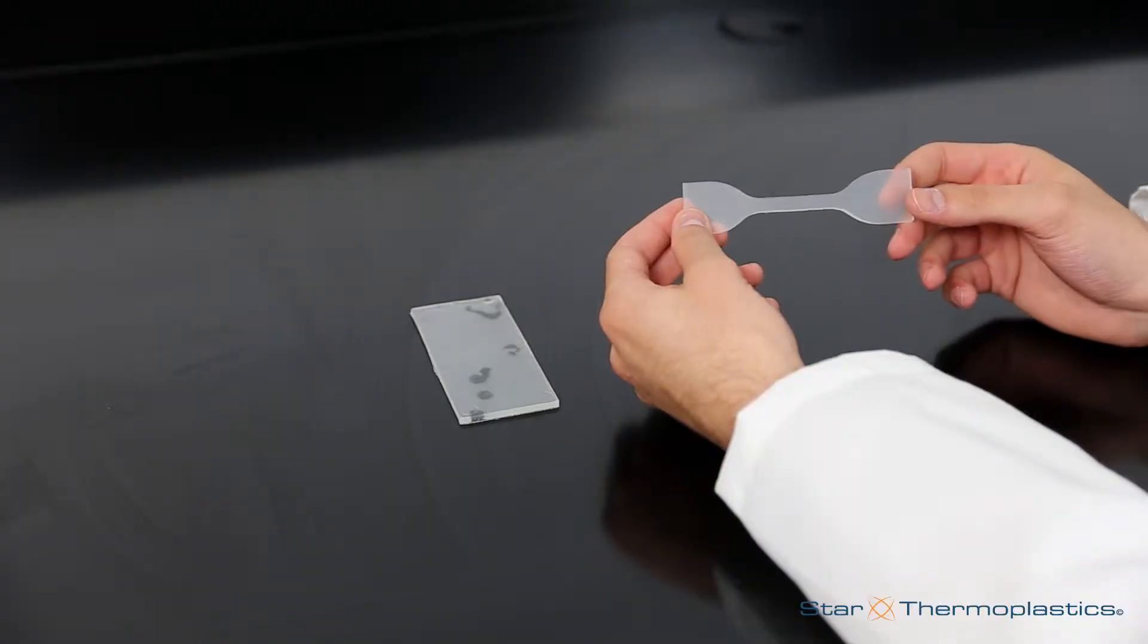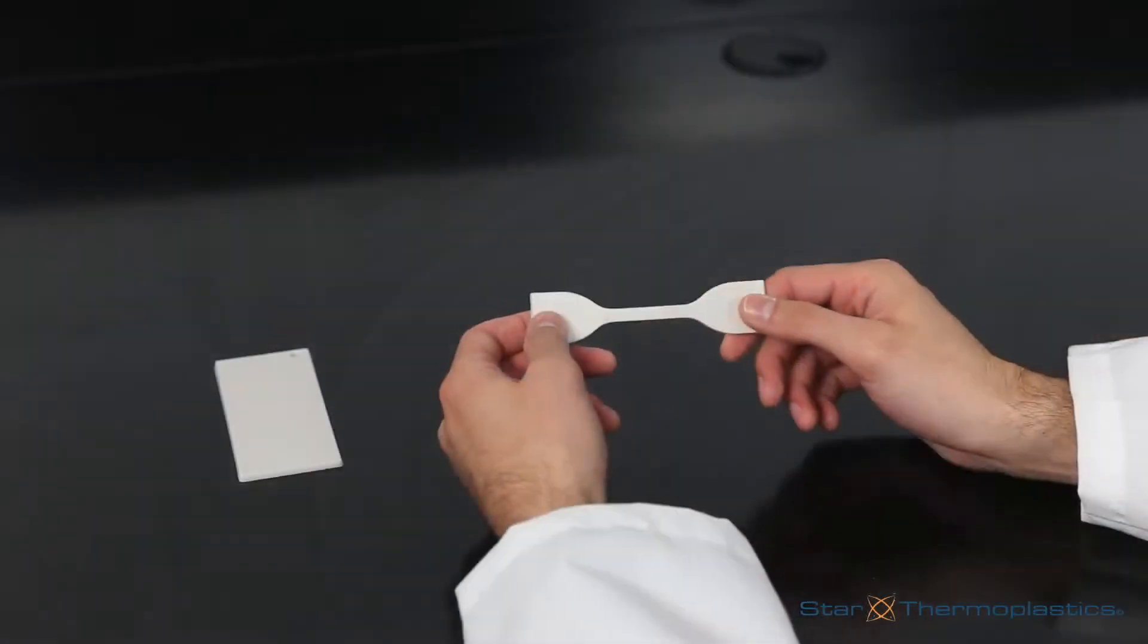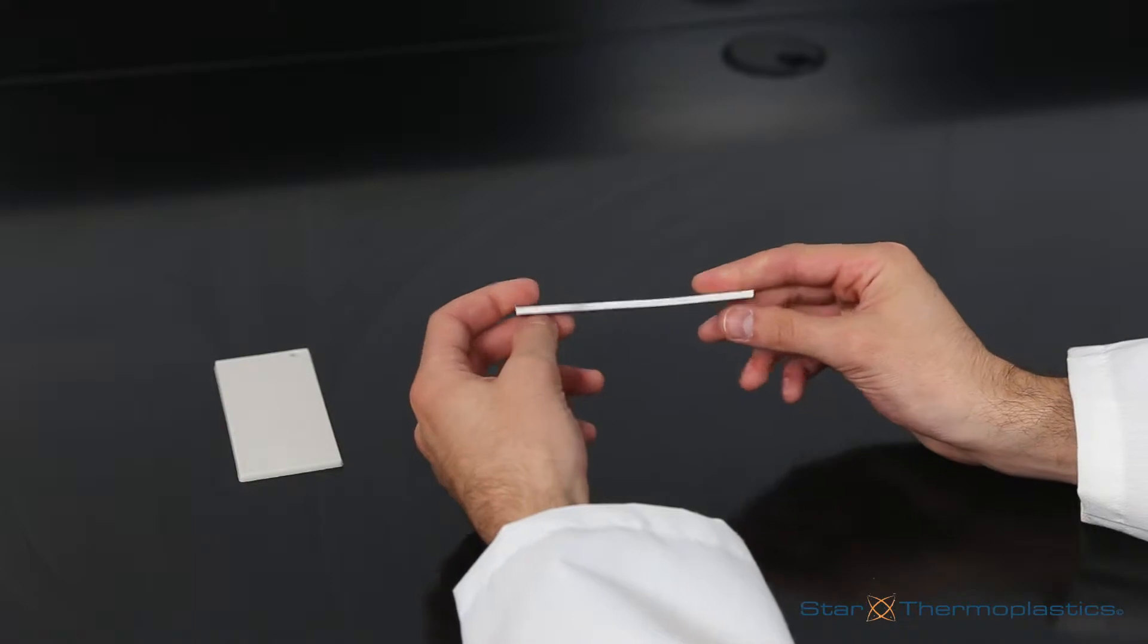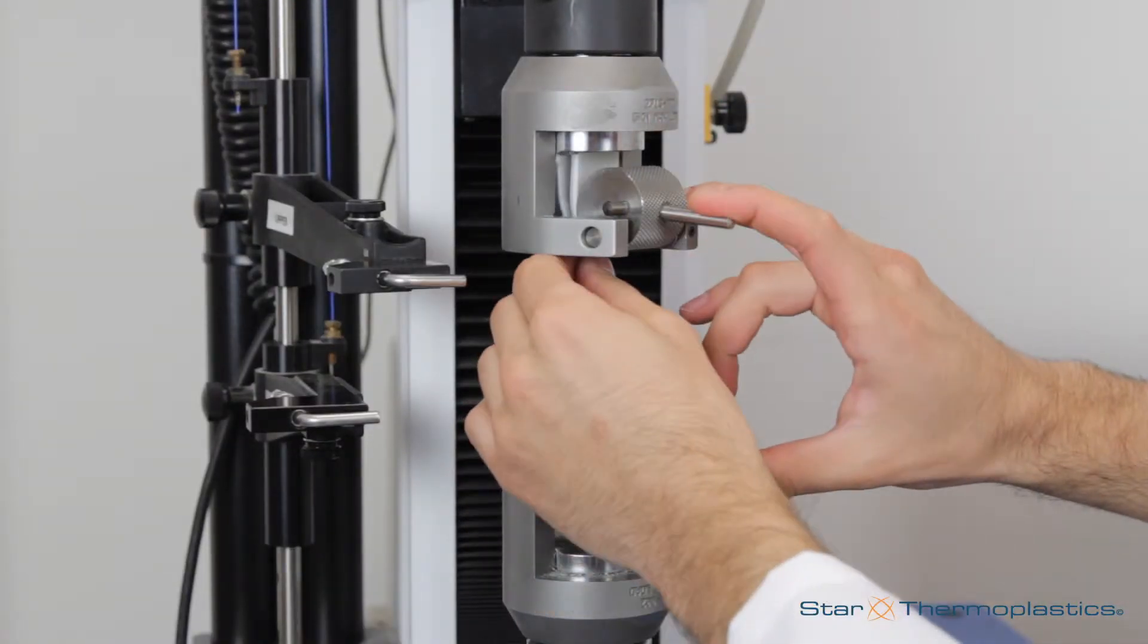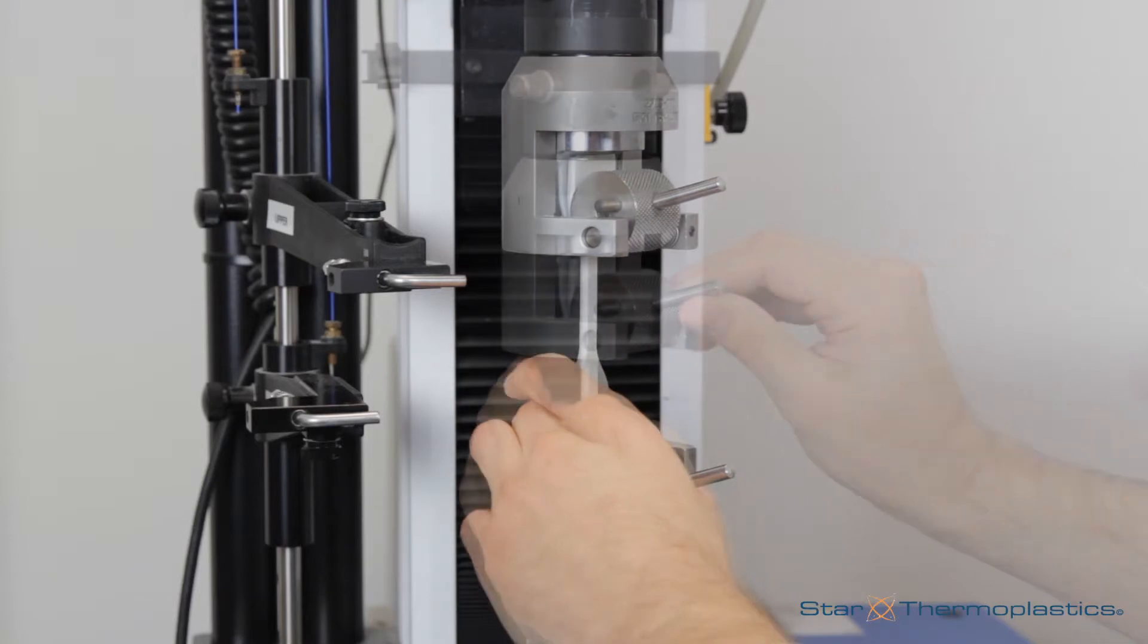You will also need a test strip that has been cut into the test shape. For our purpose, we cut them into a dumbbell shape. The test material is secured in place with grippers, and then we initiate the test.